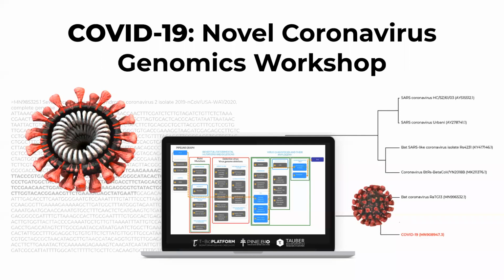Welcome to the workshop on COVID-19, a novel coronavirus genomics workshop. In this workshop, we'll speak about genomics data analysis and try to understand how analysis tools can help detect viral genomes and next-generation sequencing data. Here, we're going to learn how to distinguish between viral strains, identify specific functionally significant changes in viral genomes, and we'll be discussing virology from a data perspective.